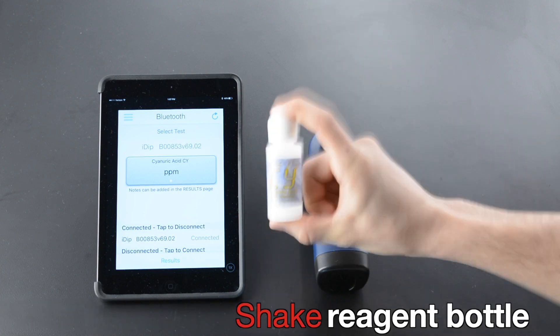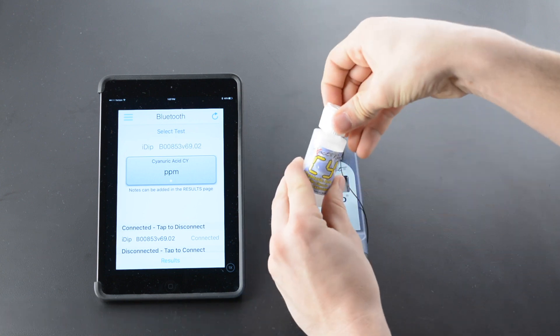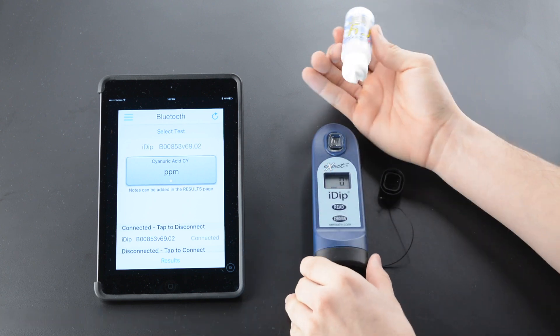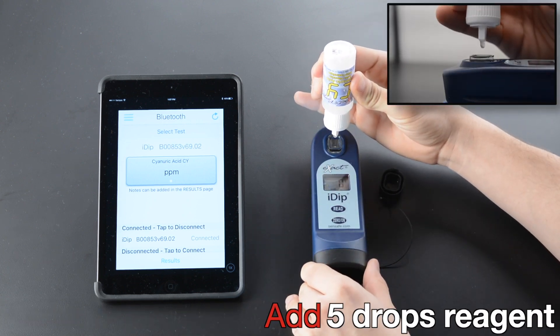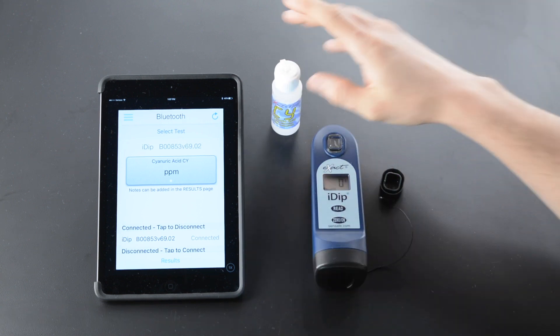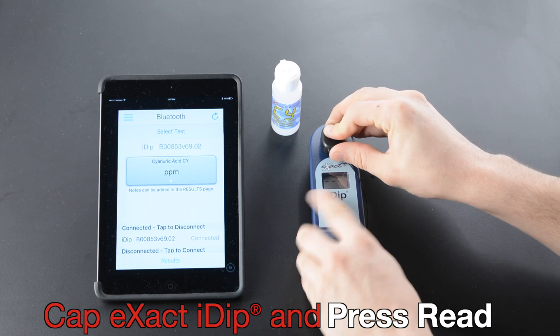Shake the reagent bottle. Remove the cap. Add five drops of reagent. Cap the Xact iDip and press Read.